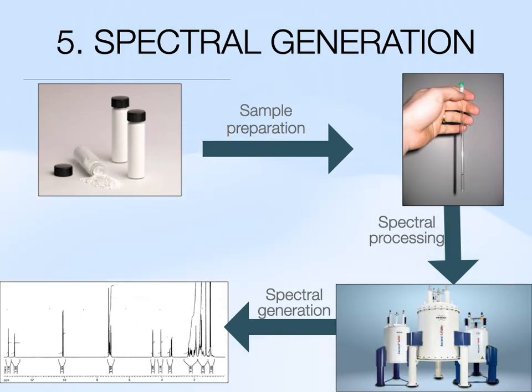And so depicted in the upper right corner is a picture of that sample in the corresponding medium needed for the instrument to be able to read it properly. So the picture specifically actually shows what is called an NMR tube, and that's actually a capillary tube that is then designed specifically for the instrument.